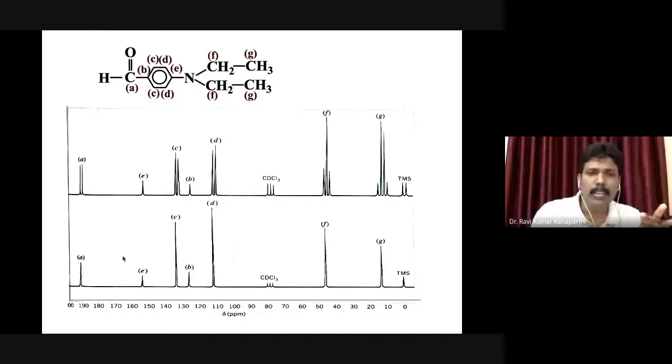Can anybody say which one is the broadband decoupling spectrum? Upper one or down one? Can anybody say which one is the broadband decoupled, and which one is the off resonance decoupled spectrum?